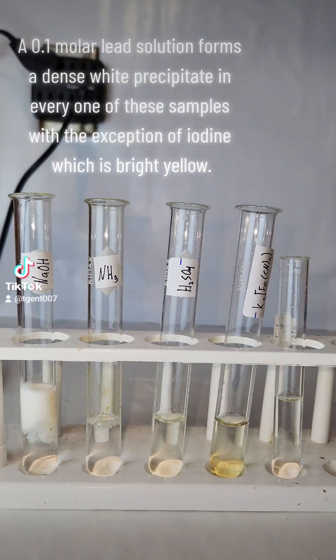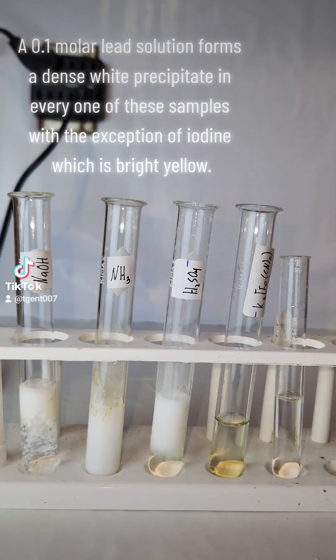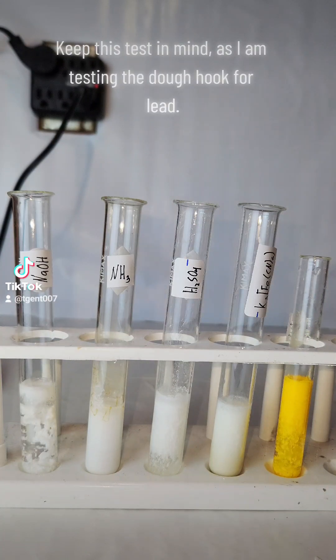A 0.1 molar lead solution forms a dense white precipitate in every one of these samples, with the exception of iodide, which is bright yellow. Keep this test in mind as I am testing the dough hook for lead.